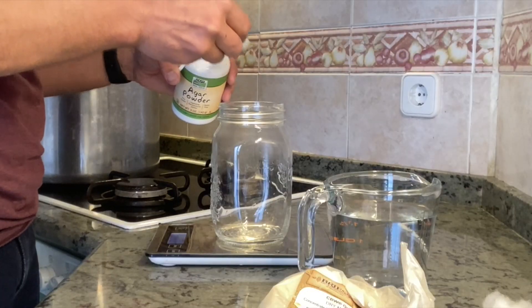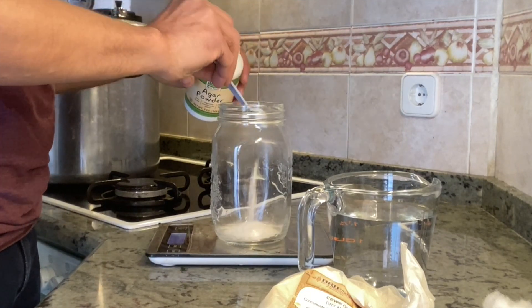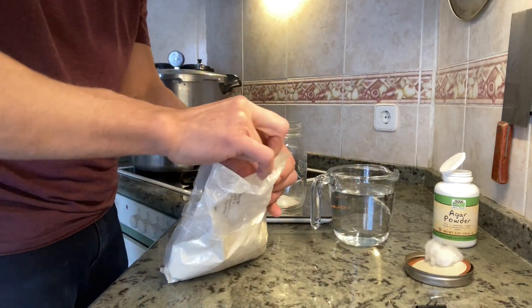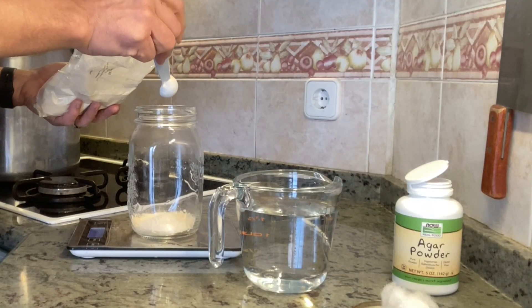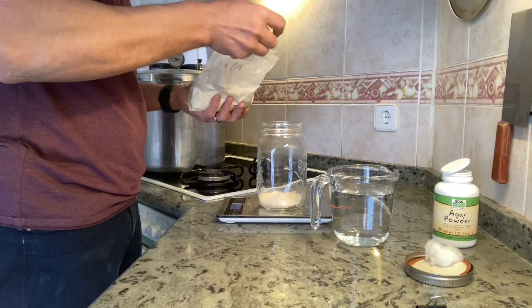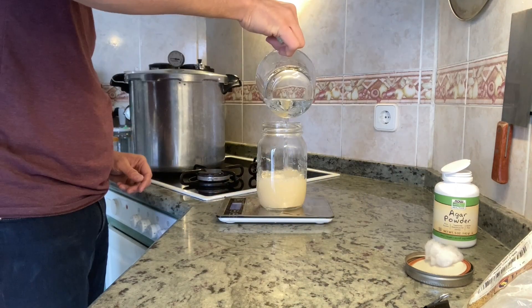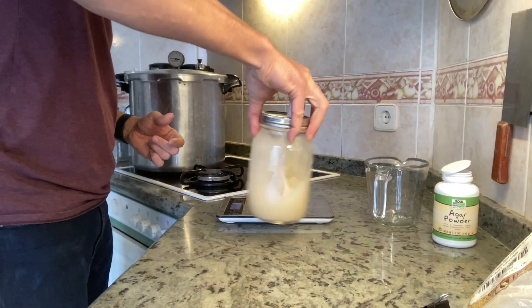We're going to start with the agar agar — 10 grams of agar agar powder and 10 grams of dry malt extract. So what I'll end up with is 20 grams of dry ingredients and 500 milliliters of water. We're going to put it in the pressure cooker. You can mix it up a little bit if you want, but it's going to mix up pretty well in the pressure cooker with all that heat and pressure.